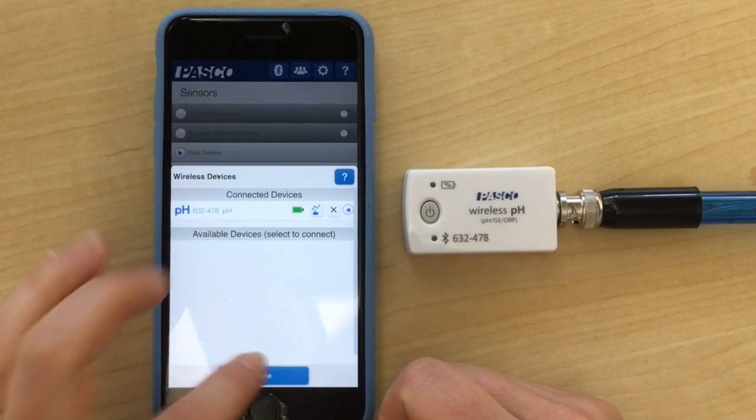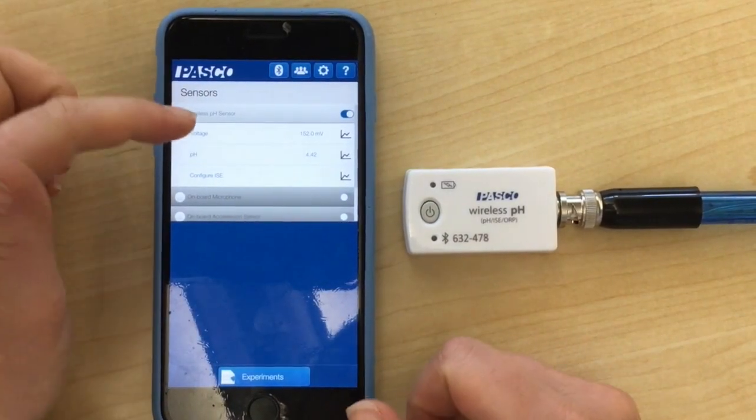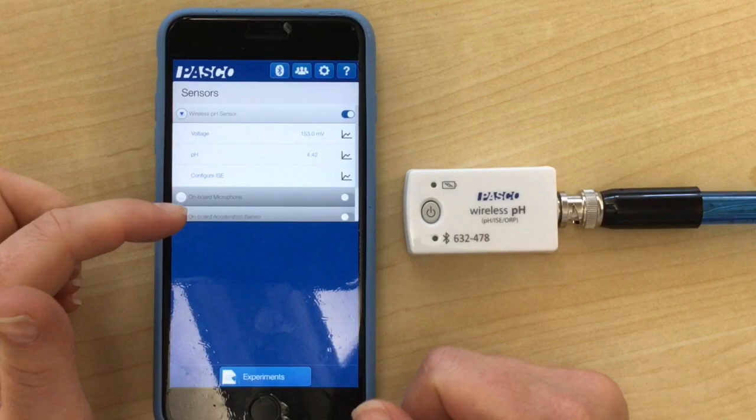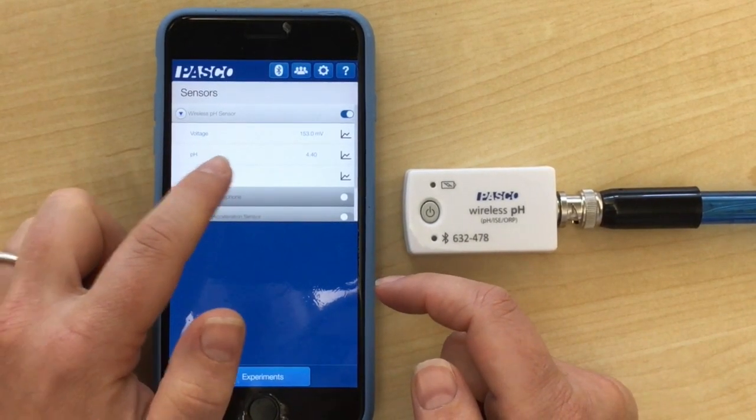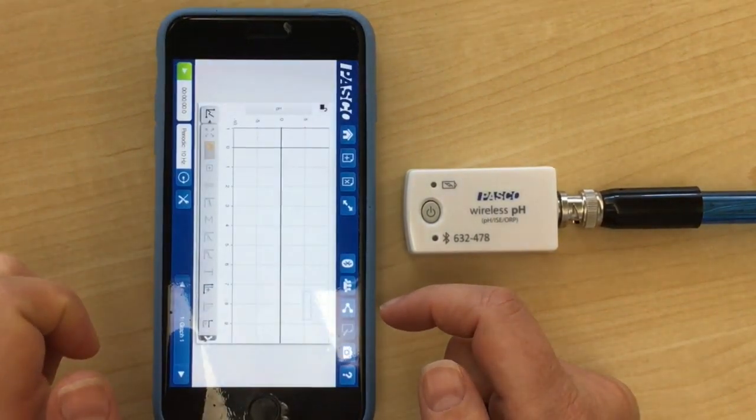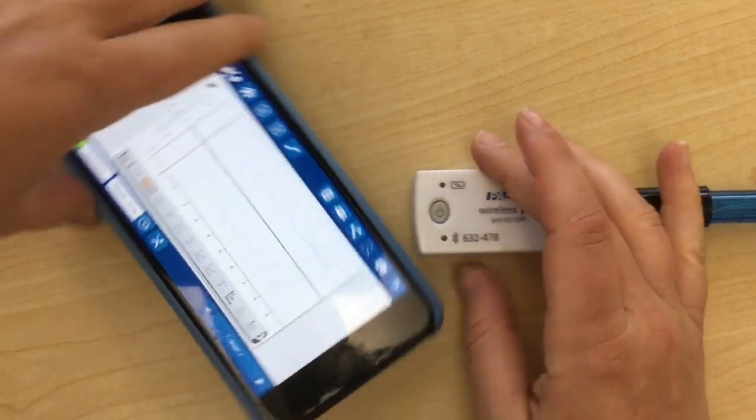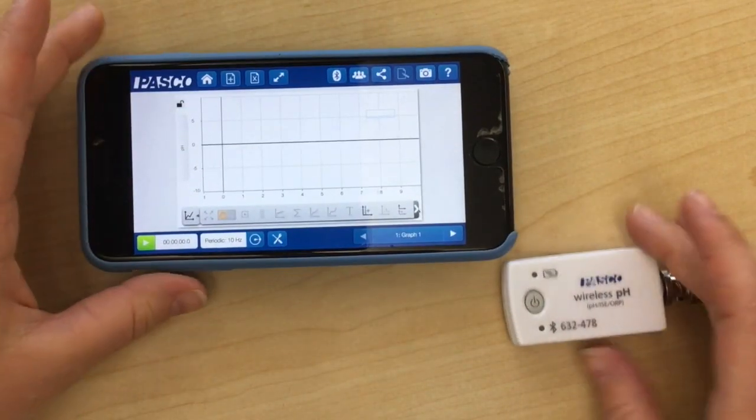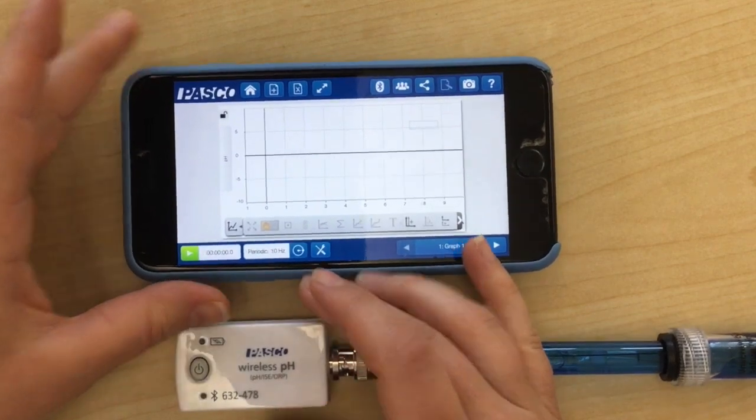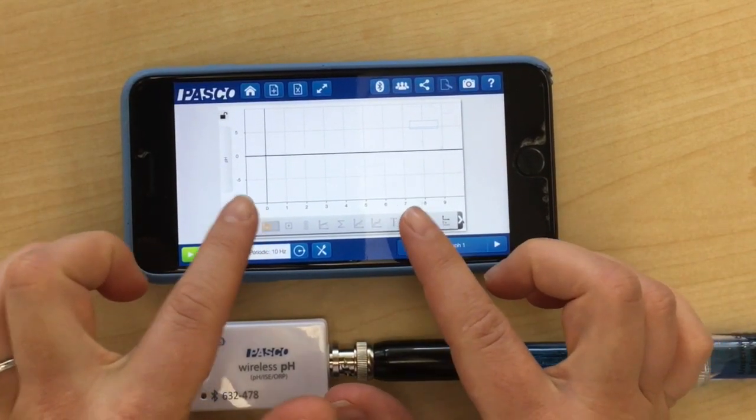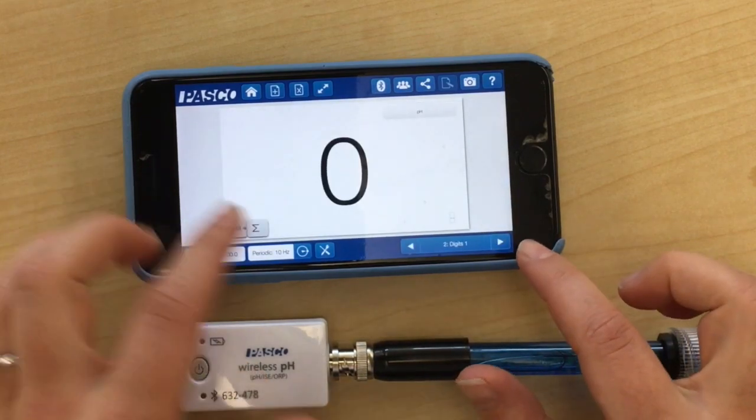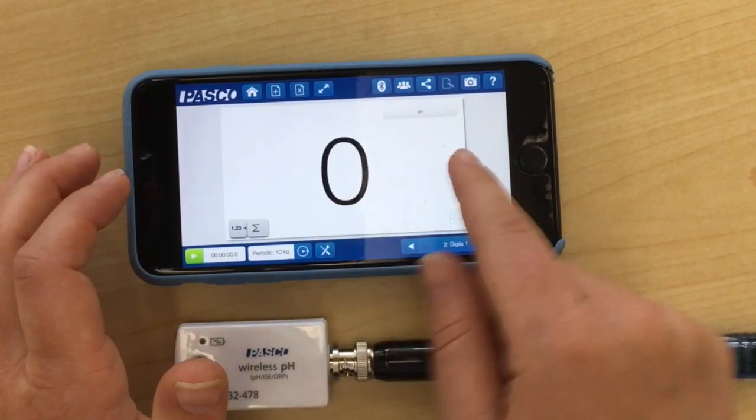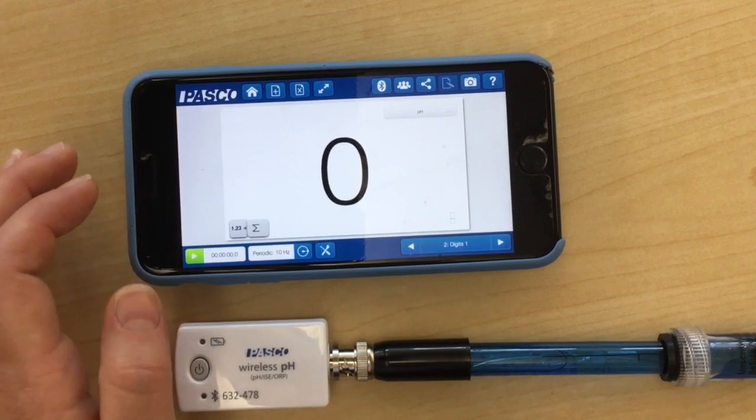I click done, and then this is where you can start taking your pH. If you click on the option that says pH, it will take you to a measuring screen and you can move your phone over to the side. You can view this as a graph or you can tab over and view it as digits. Best to use digits for this lab.